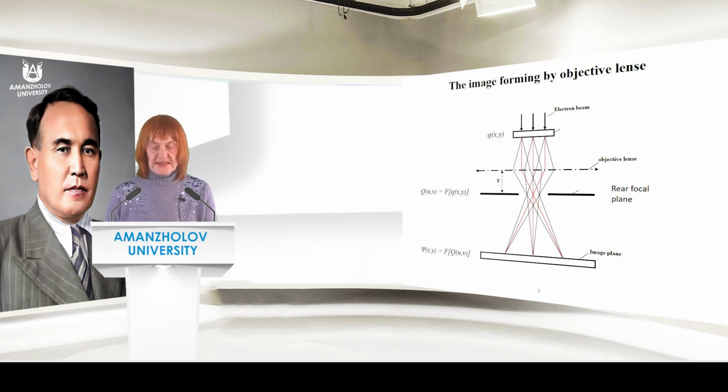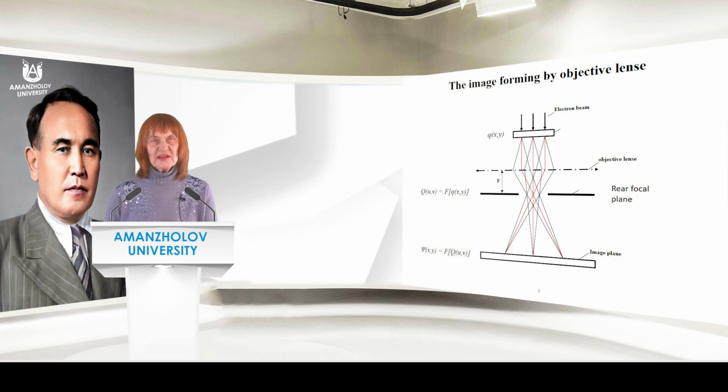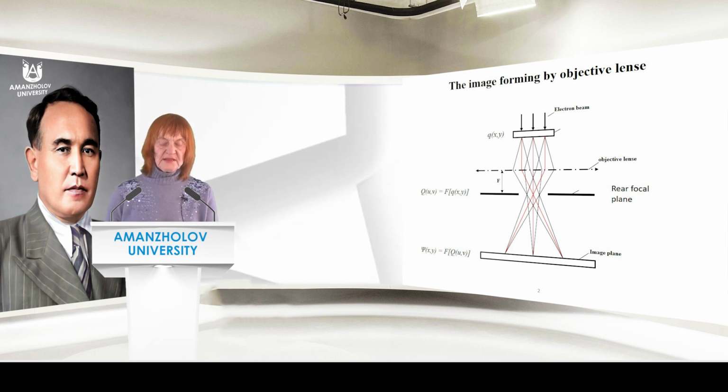Using specifically designed sample holders allows in situ study of magnetic domain structure evolution depending on temperature, external magnetic field, strain, etc. The defocus method is usually used for magnetic domain structure study, in which domain walls are observed as light and dark contrast on magnetic domain boundaries.